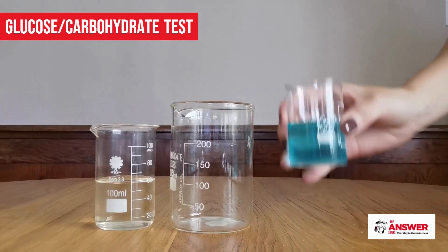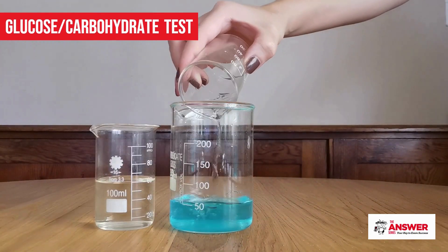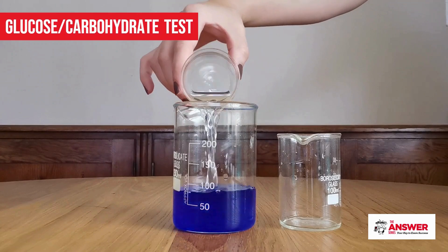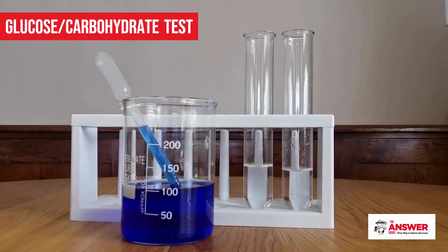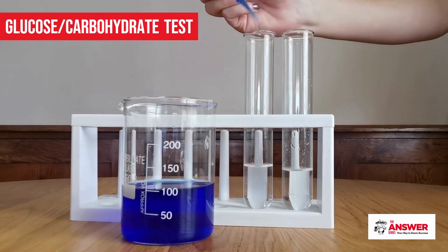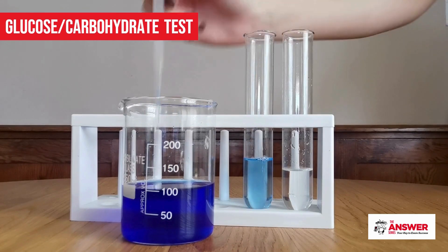Mix equal parts of Fehling's A and B together just before use. You will notice the solution become a deep blue color. Add some dissolved glucose powder into one test tube and water into another — the water will serve as the control. Then add a few drops of the combined Fehling's A and B solution to each test tube.